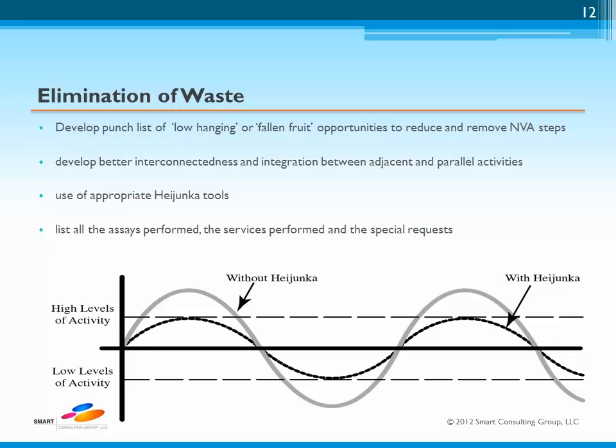In many laboratory applications, waste associated with waiting around often accounts for a significant percentage of the total non-added value component, which affects turnaround performance, for example. Some authorities in our field indicate that this may be as high as 50%.